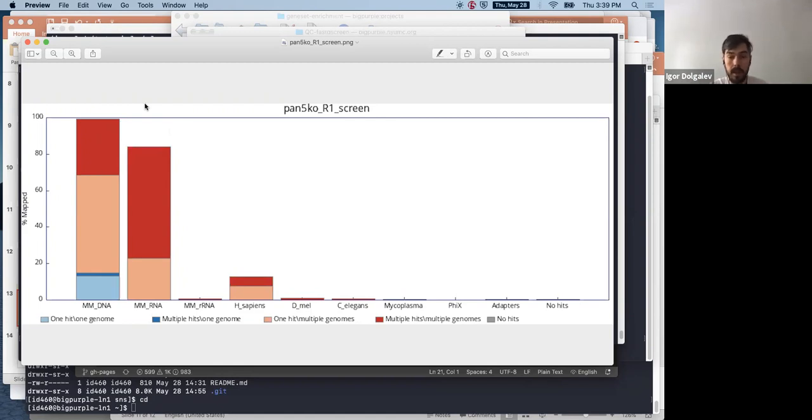There are various possibilities there, but the possibility that most people get excited about is that we have all these unannotated non-coding RNAs that maybe are interesting. But of course that could be very difficult to really pin down, and that requires a lot of additional analysis.